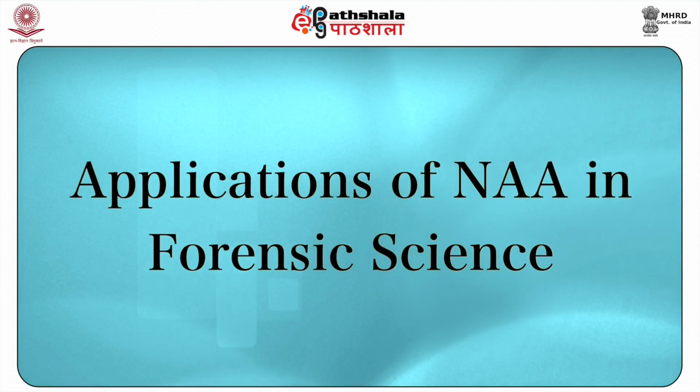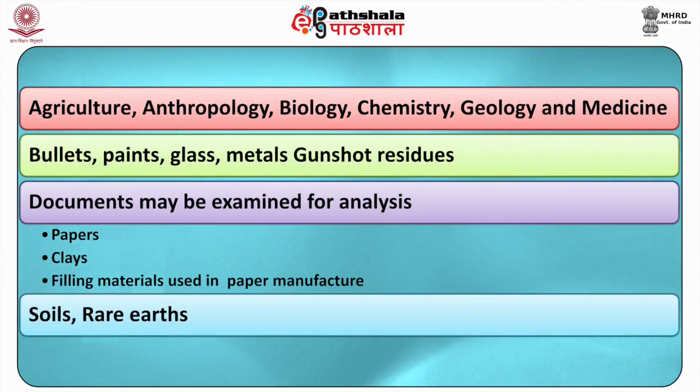Applications of NAA in forensic science. It has wide applications in agriculture, anthropology, biology, chemistry, geology, and medicine. Analysis of bullets, paints, glass, metals, gunshot residue, GSR particles. Documents may be examined for analysis of paper, clays, filling materials used in paper manufacture, soils, rare earths.